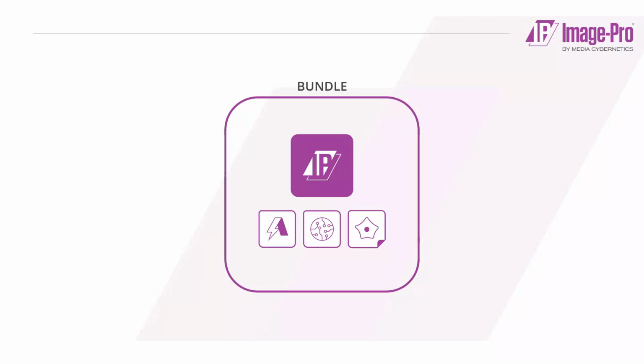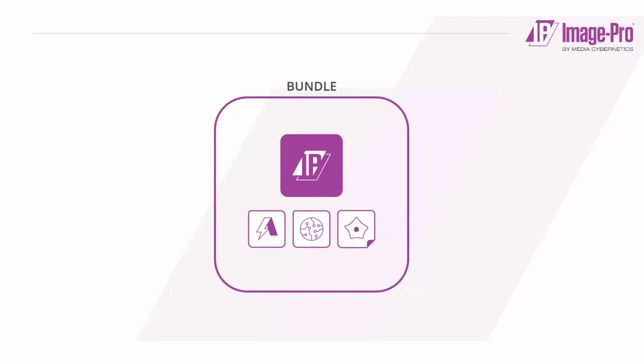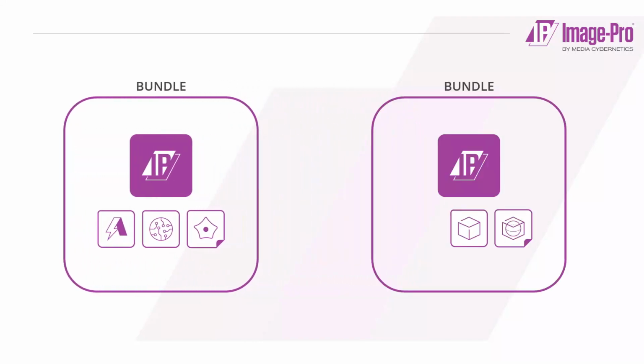Here we see an illustration of a bundle that includes the Image-Pro base product, the AutoQuant module, the 2D automated analysis module, and cell biology protocols. Bundles are flexible and can be reconfigured. Here we see an illustration of the AutoQuant deconvolution module being moved to a second bundle.